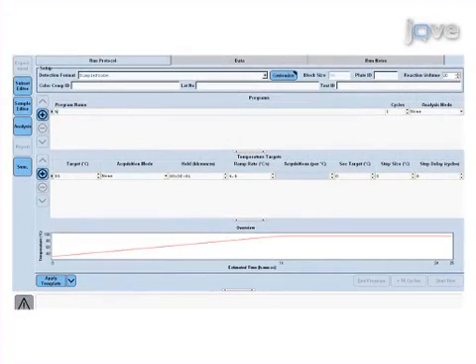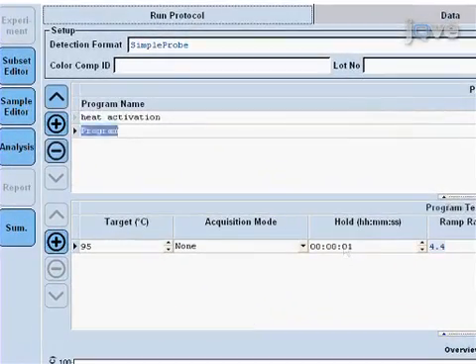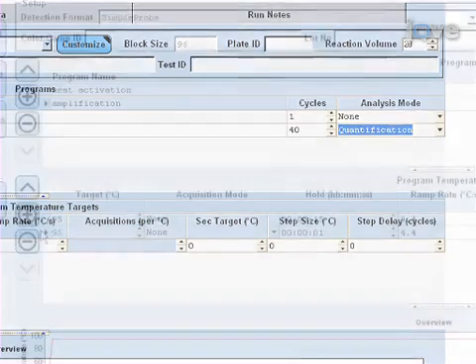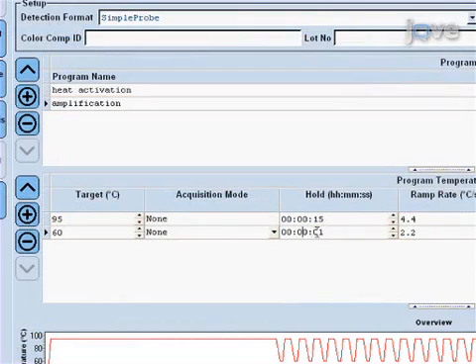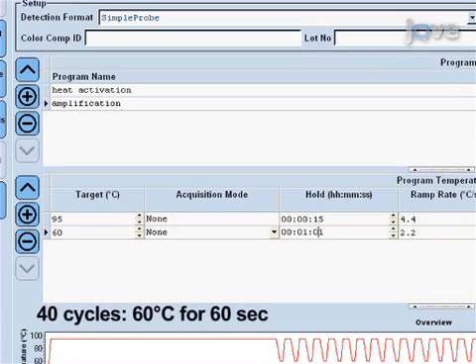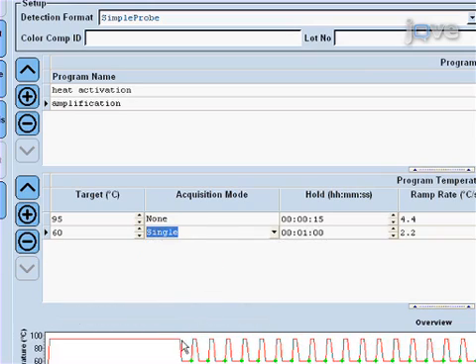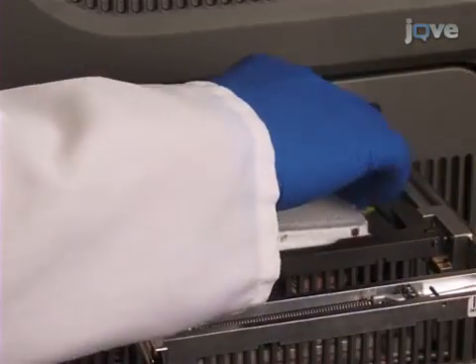Program the thermocycler. The hot start polymerase in the Solaris qPCR master mix must be activated at 95 degrees Celsius for 15 minutes, one cycle. Then run 40 cycles of 95 degrees Celsius denaturation for 15 seconds, and annealing and extension at 60 degrees Celsius for 60 seconds. This protocol is the same for all Solaris qPCR assays, regardless of the gene being amplified. Finally, place the plate in the qPCR instrument and start the program.